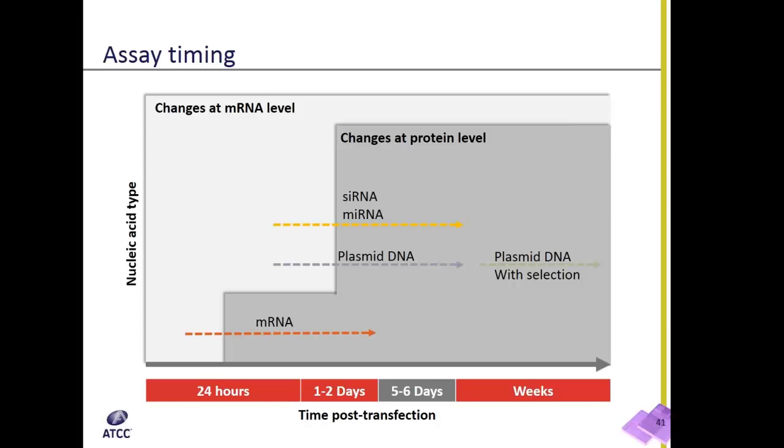So for all substrates, you should run a time point analysis, as the optimal time will vary by substrate and cell type. Remember, for plasmid DNA, you need to allow for mitosis to occur before running your analysis. Analysis of mRNA transfections for protein expression can be done 12 to 36 hours post-transfection. For protein detection, 24 to 72 hours post-transfection should be okay, but the optimal time will depend on the protein complexity, stability, and the analysis method being employed.